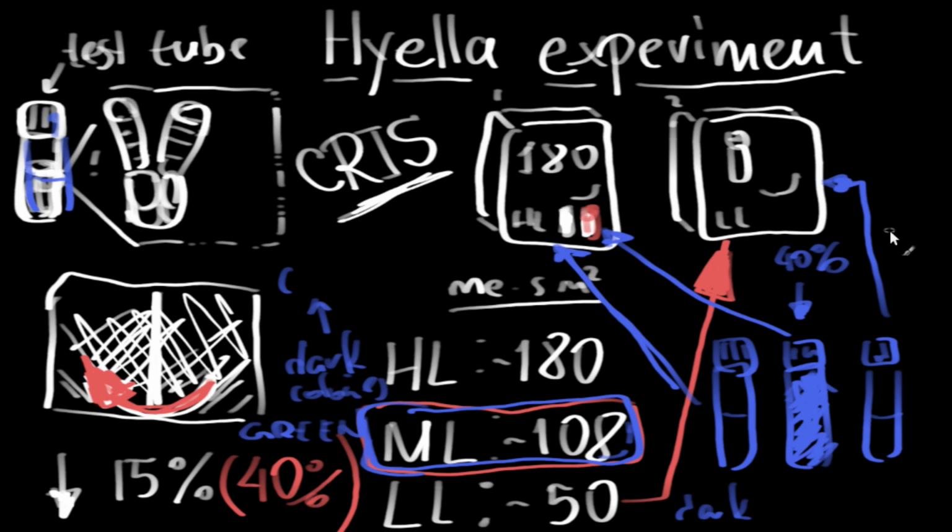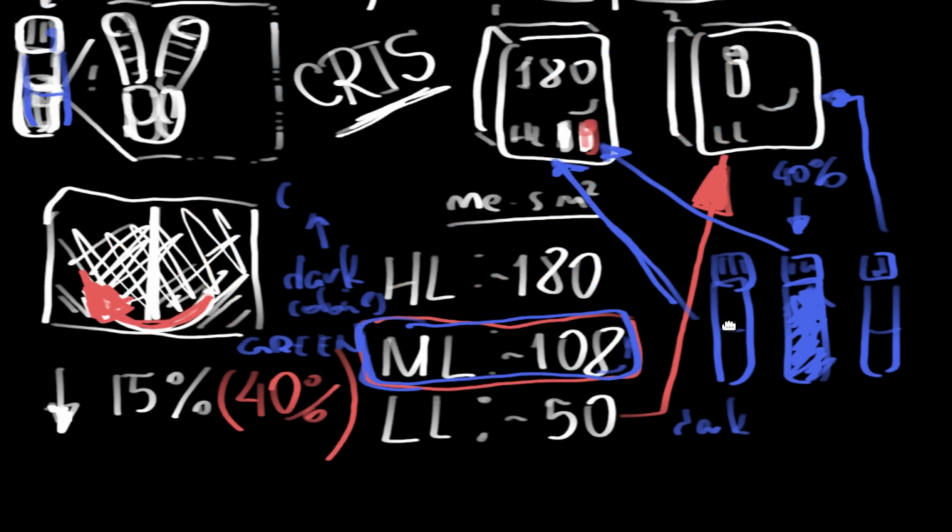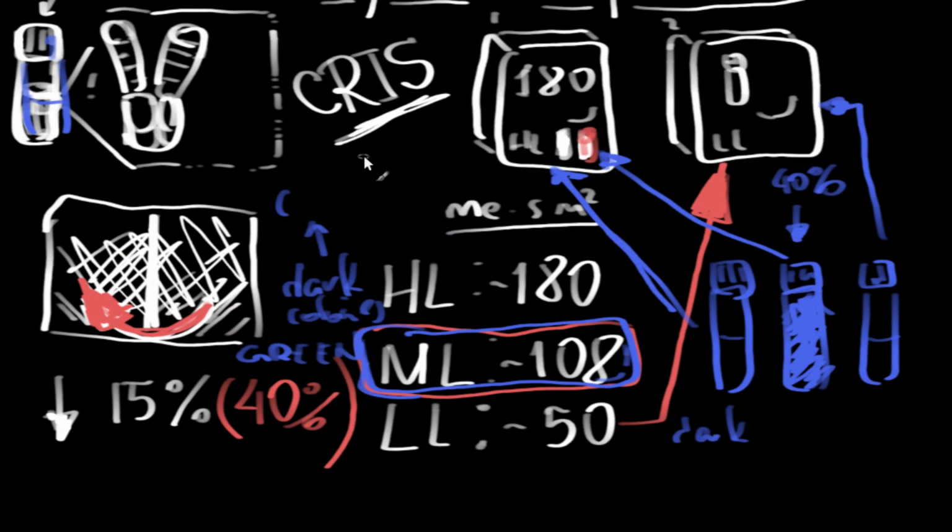And also we're gonna have a test tube flask shaped like this, and we gonna put media with the cultures from this tube as well, and we will grow it for lipid analysis and pigment analysis, and also for DNA extraction.